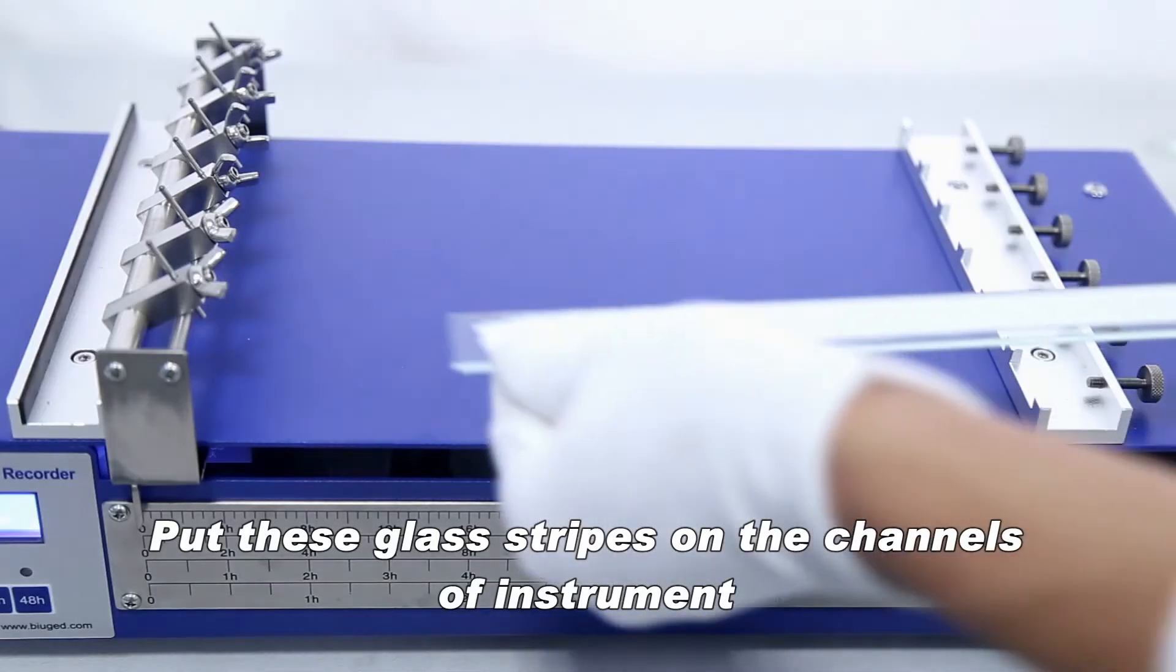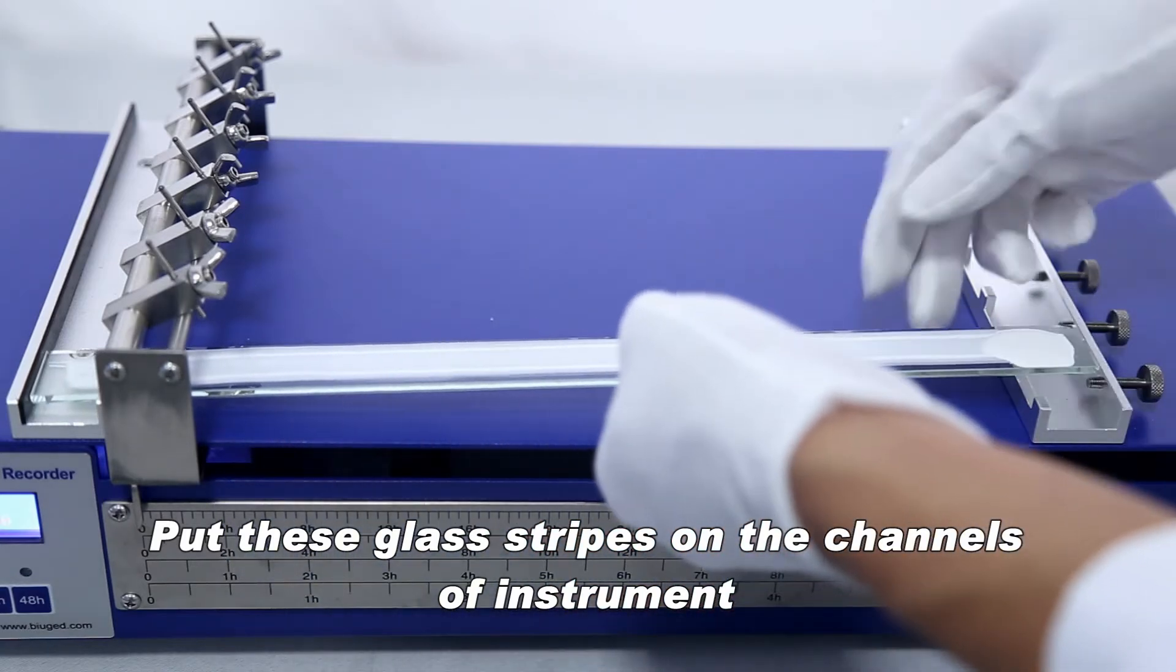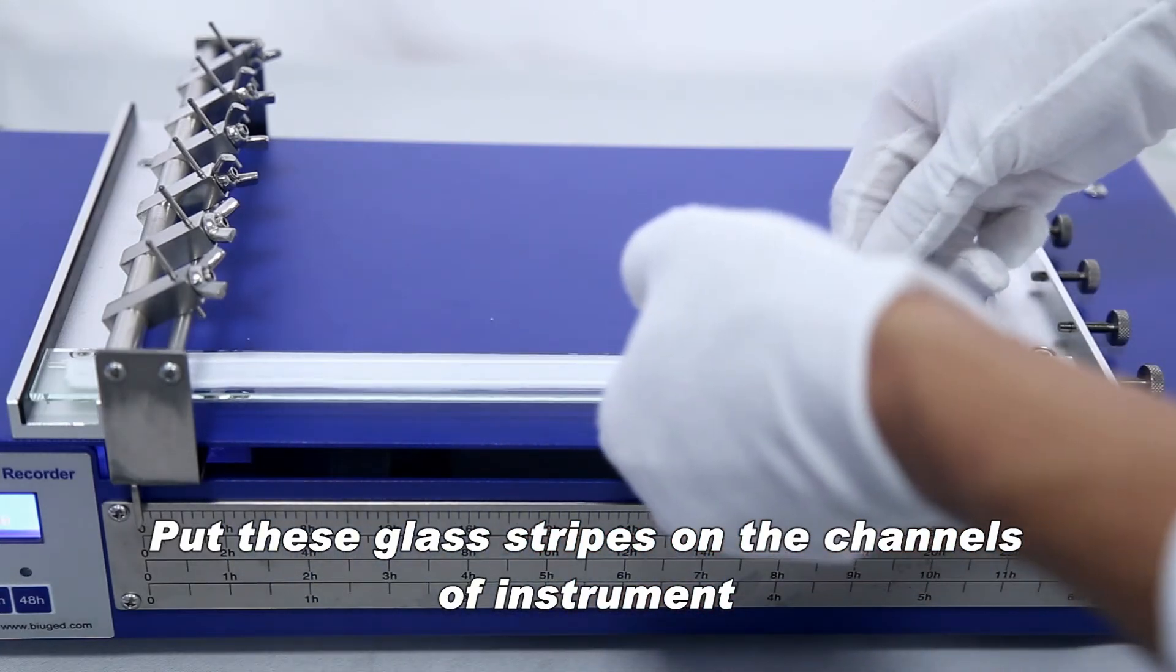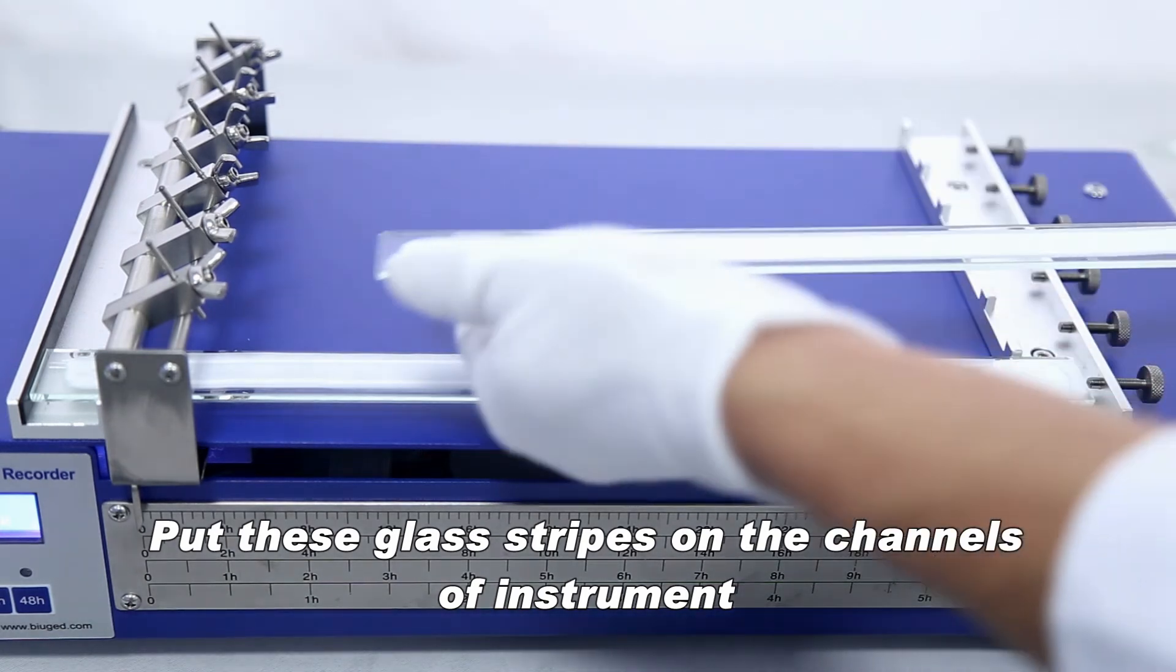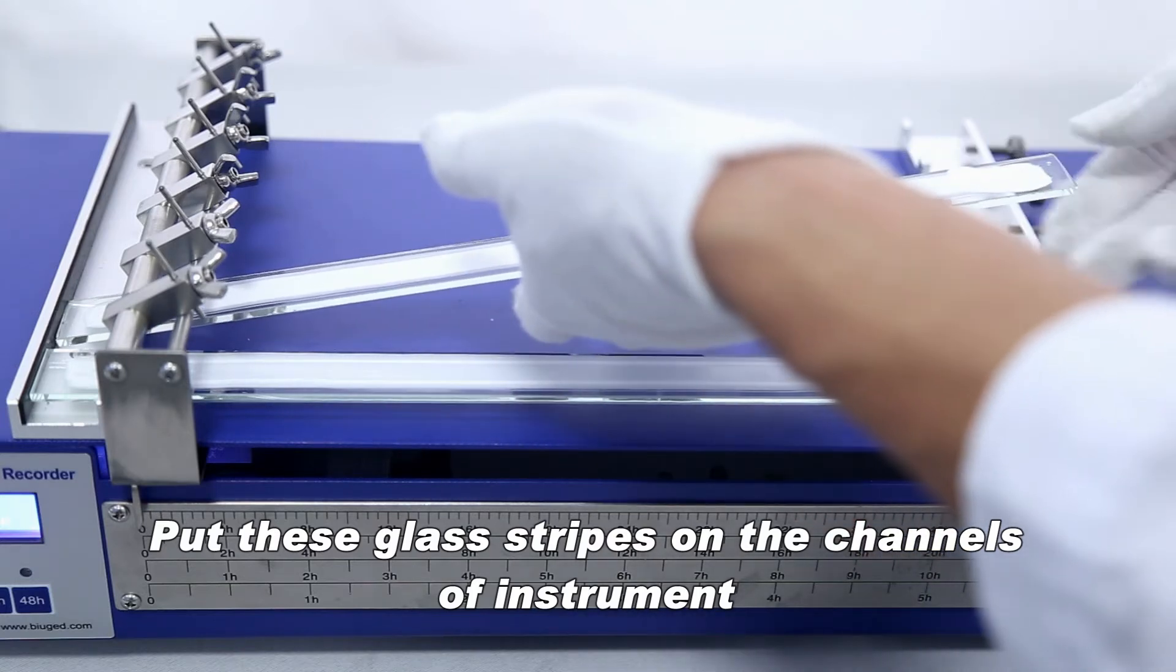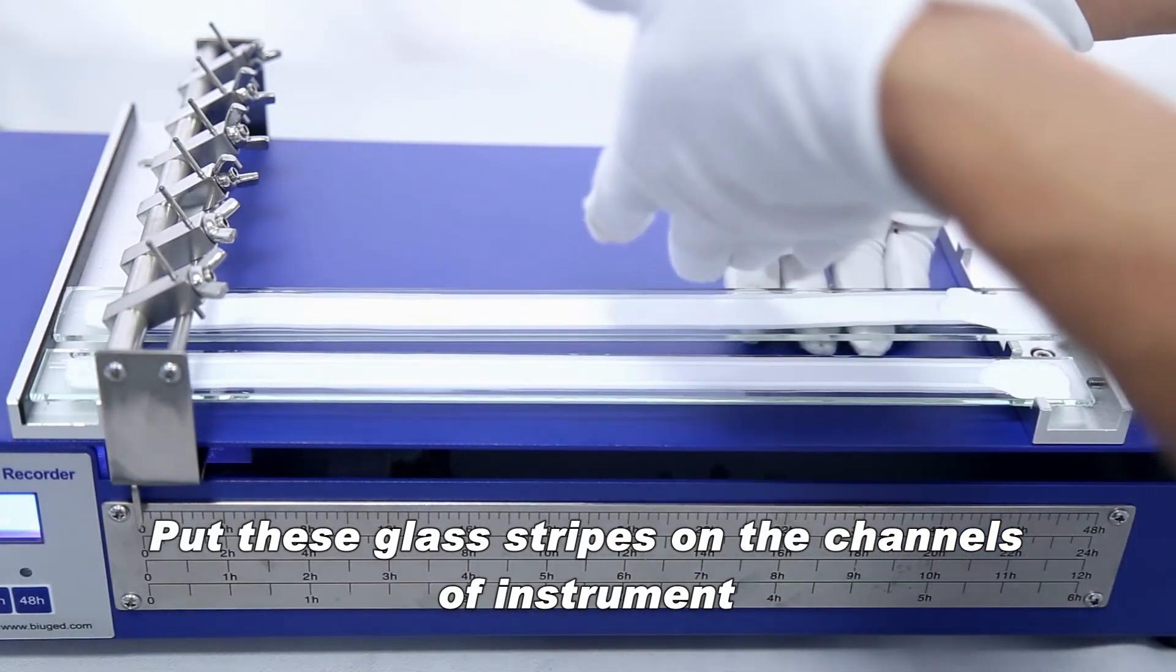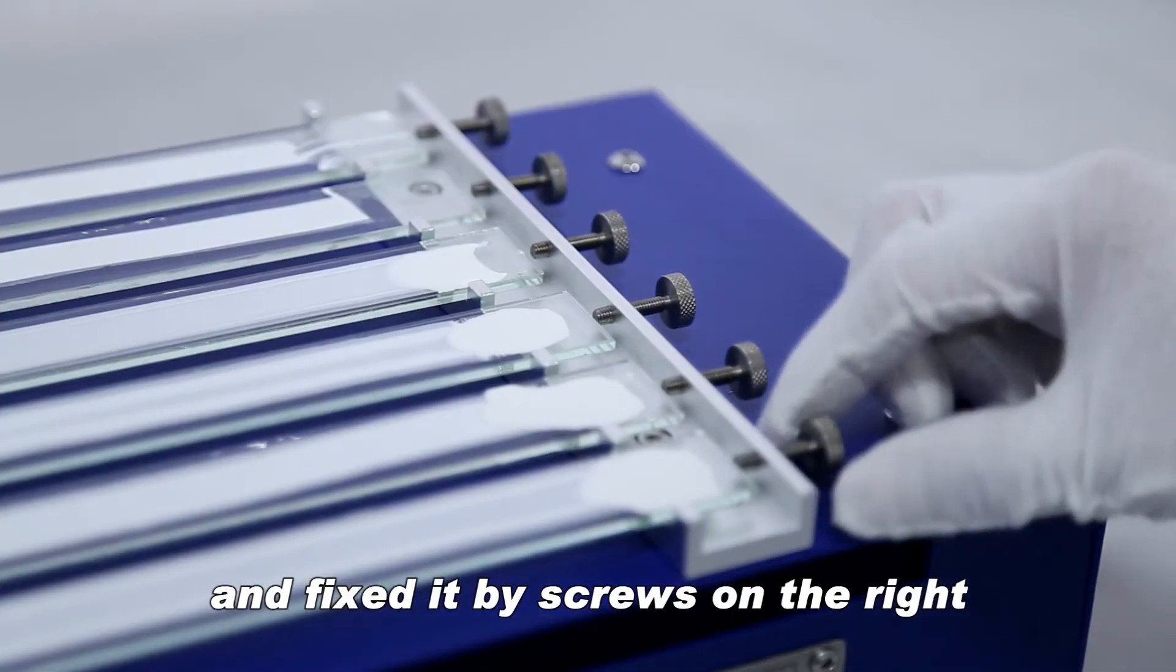Put the glass stripes on the channels of the instrument and fix them by screws on the right.